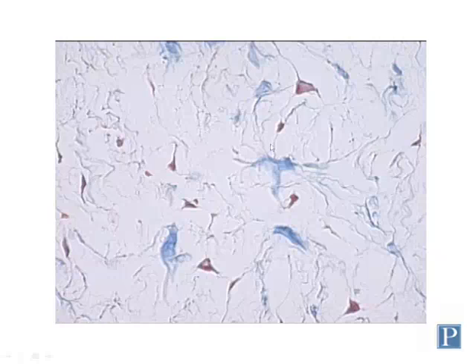This is a slide showing mucus tissue or mucoid connective tissue. This is another embryonic loose connective tissue. This tissue actually contains fibroblasts. So in mesenchyme, the cells are called mesenchymal cells. Here they have differentiated into fibroblasts.